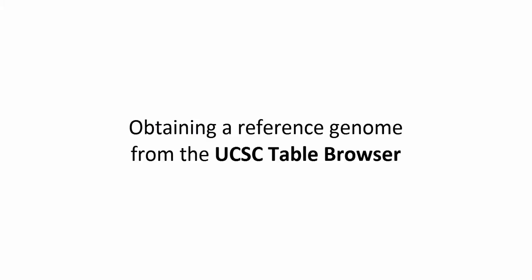Hello from GenomeSpace! In this video step, we will go over the process of obtaining a reference genome from the UCSC Table Browser.